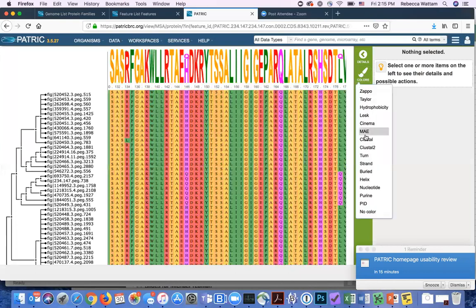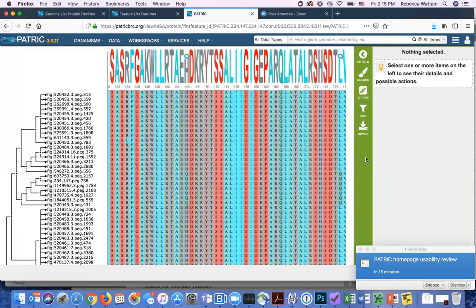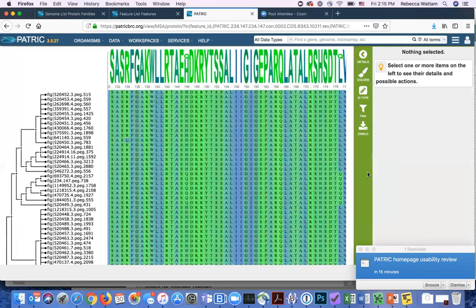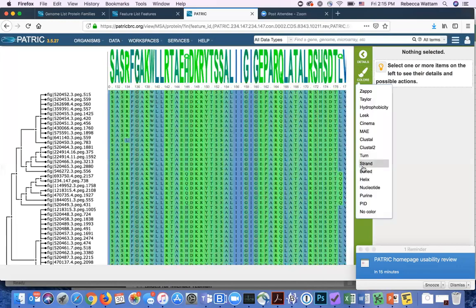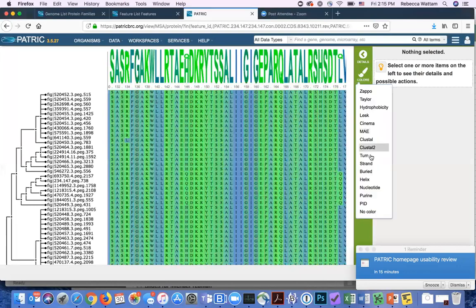So it's kind of fun to play with and that's what we have in PATRIC for you to be able to very quickly, very easily build a multiple sequence alignment.